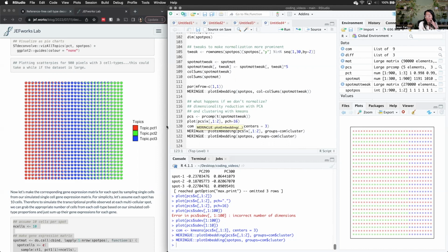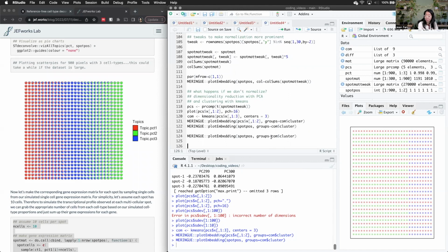Yeah, to our simulation. And actually, let's see what happens if we plot this again to remind ourselves. Plot both of these things, but color it based on the library size.